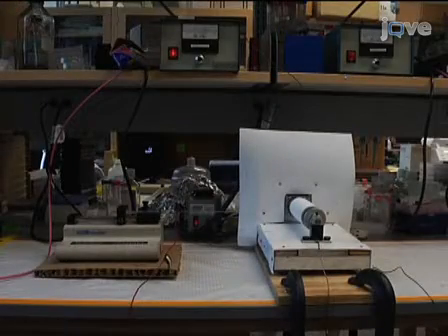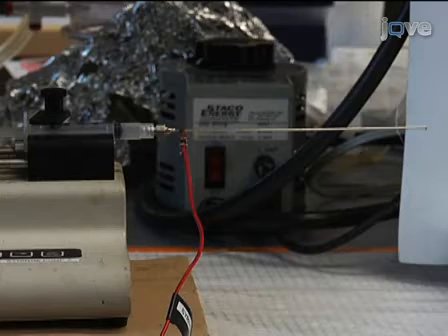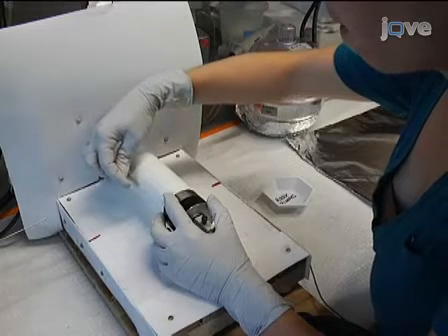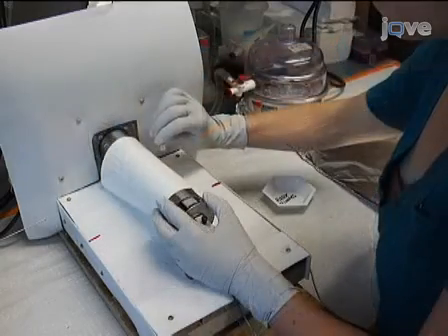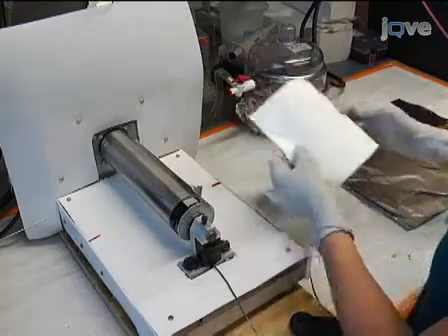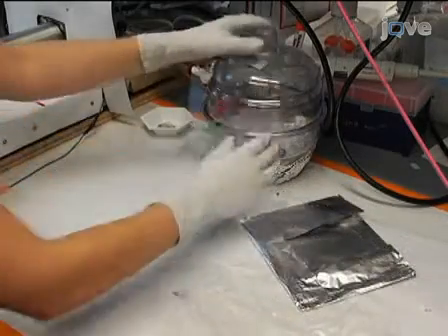The collection time depends on the desired thickness and the volume of electrospinning solution used. For photopatterning, we use electrospun mats spun for 16 hours. Remove the scaffold from the collection apparatus after collection is complete, and store it under vacuum overnight for complete removal of the solvent.